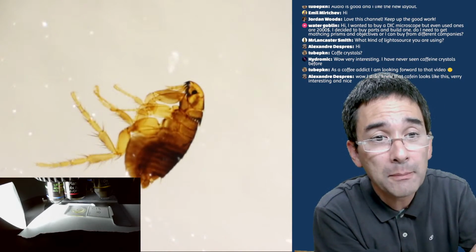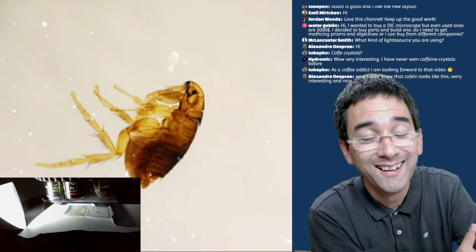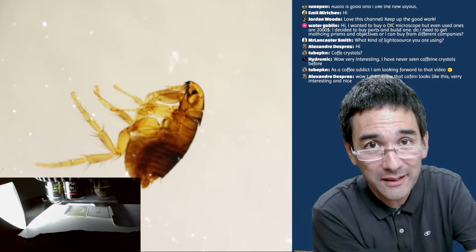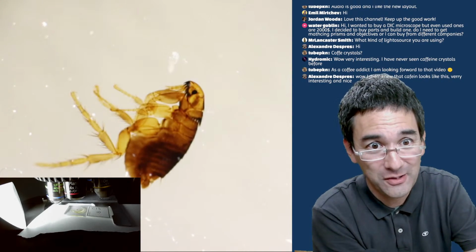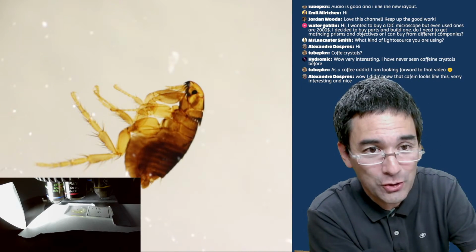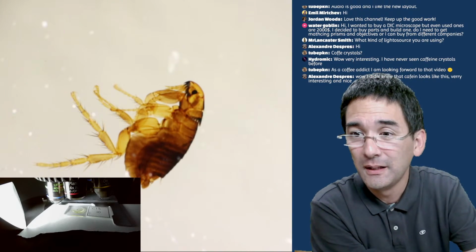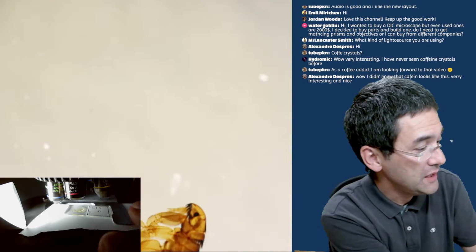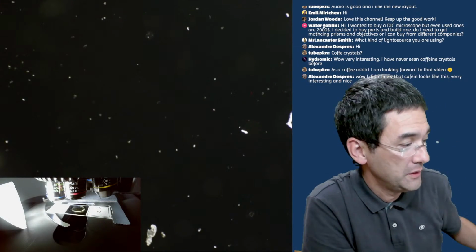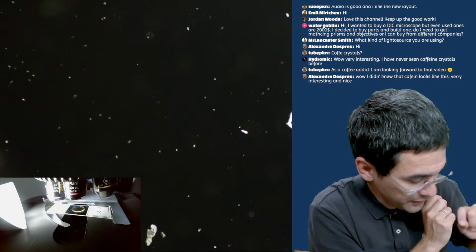There's the same thing just with paper. It looks pretty much the same. Now it works. What happens? Well, essentially the paper reflects the light. So it's again light coming from the bottom, just like before. So you see that it's simply a demonstration that certain specimens must have light coming from the bottom. This is just a short demonstration here. And then you see, if you take it away, it's dark again. So let's move on to a few other things here.